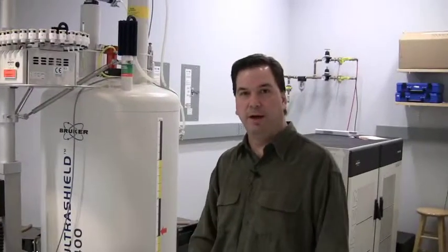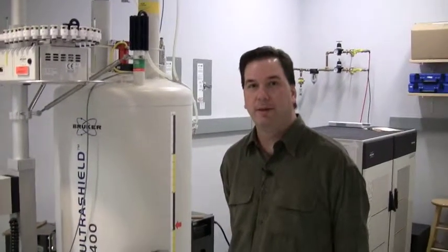We could get up to about a factor of 5, and in some cases a factor of 6, increase in sensitivity over normal traditional NMR spectra that are run on instruments that do not have this cryoprobe or LC-SPE accessory. I'm here now in our satellite facility located in MRB4 on the 12th floor.